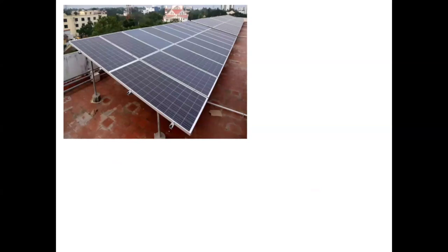Is it really odd to the topic now, or can you connect it? Why am I showing a solar panel now? What is a solar panel? It is also a detector. Very good. What type of detector is that? It's a photodiode. Yeah, this is a photodiode.